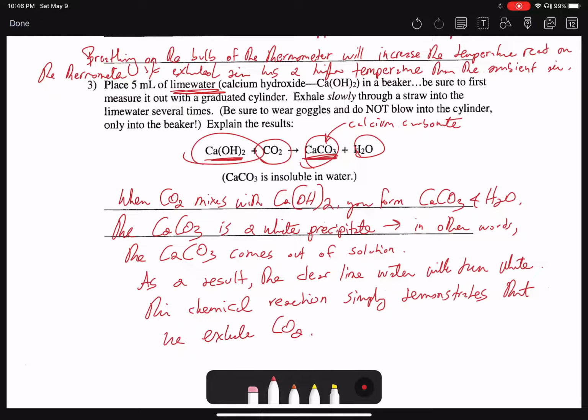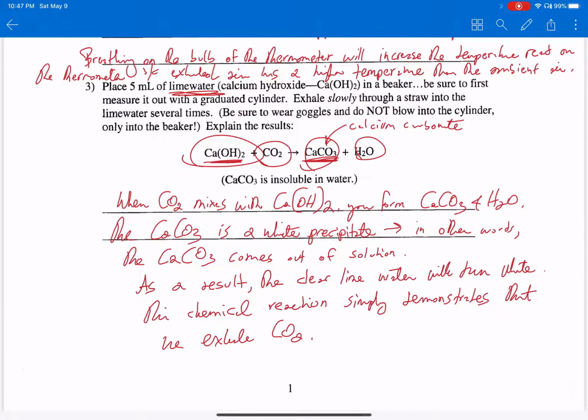So this simple chemical reaction here is meant as a setup for the next chemical reaction, which is a little bit more complex. So now you get the concept that we're basically forming an assay, if you will, a means of measuring something based on a simple chemical reaction through which we're measuring the levels of CO2 based on how fast it takes to change this solution.